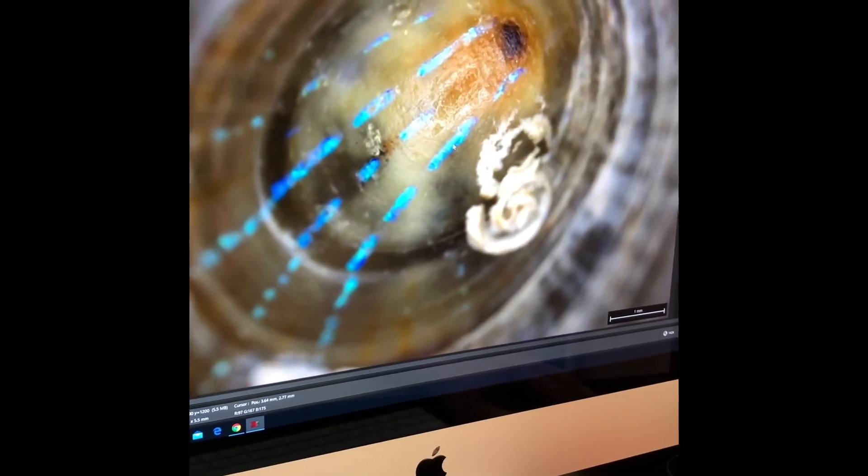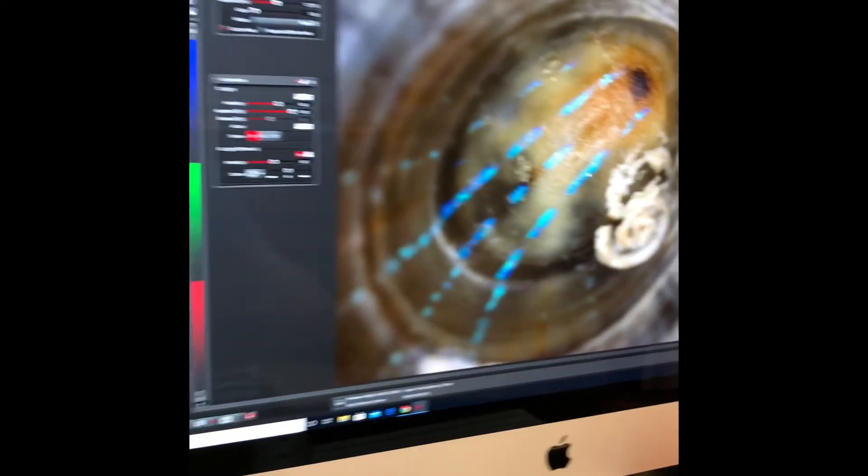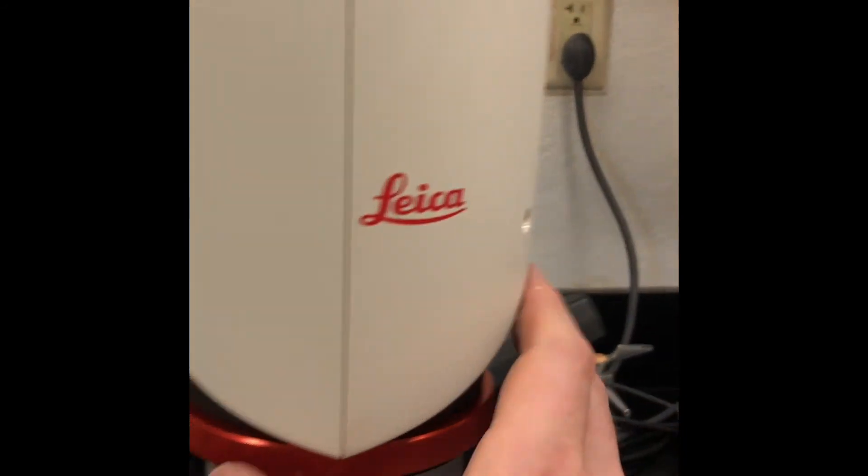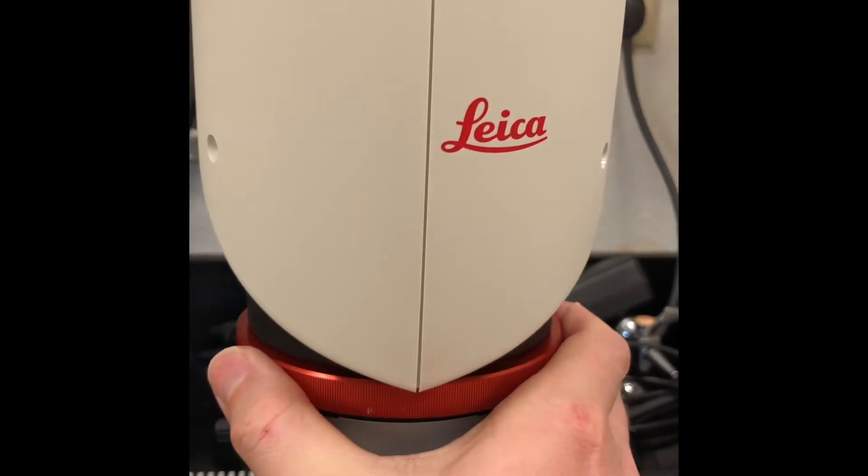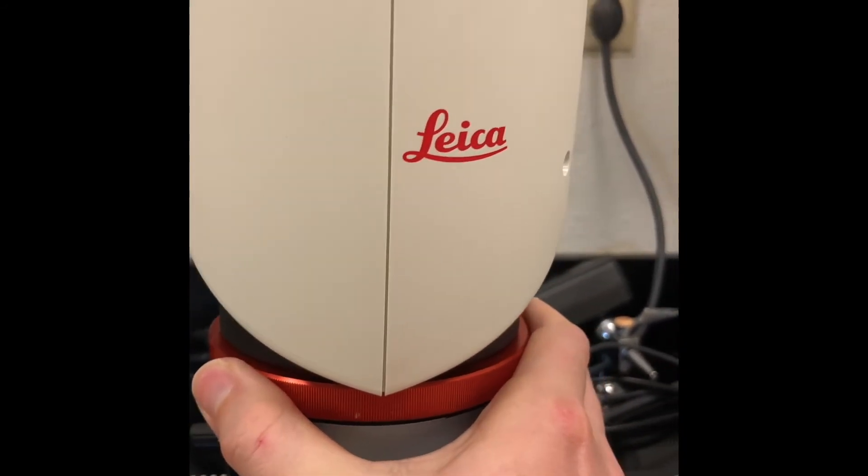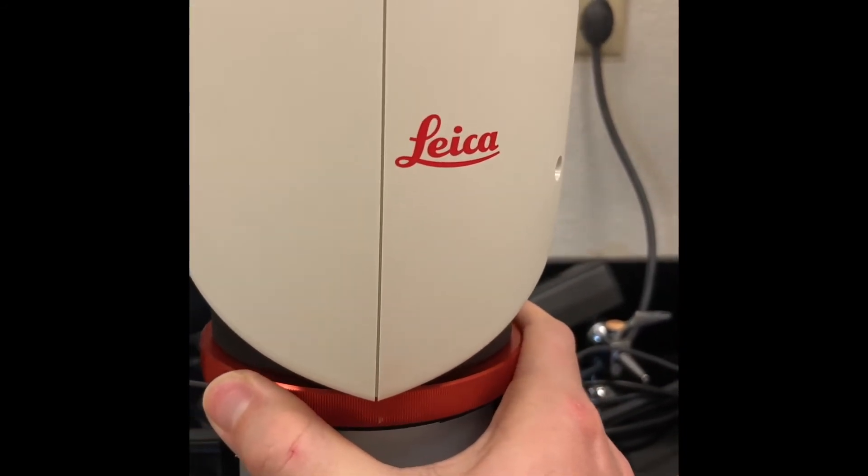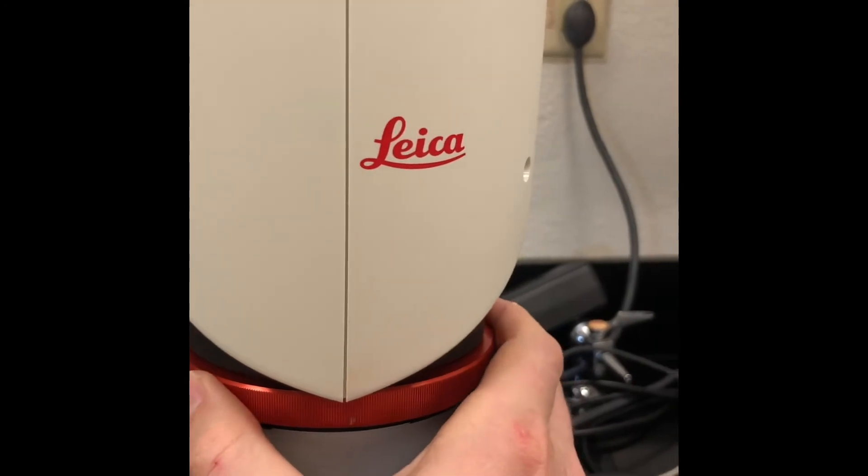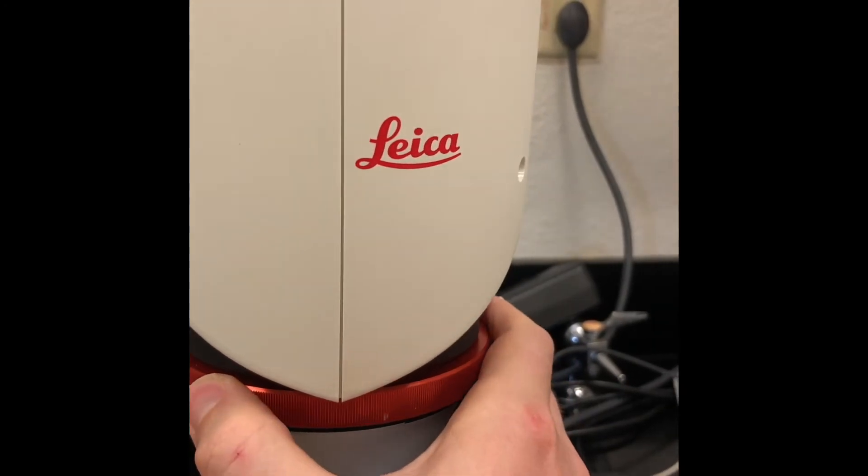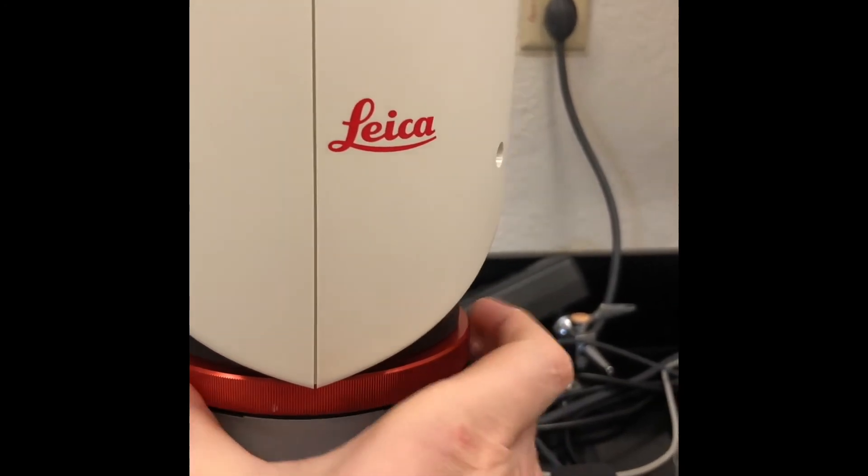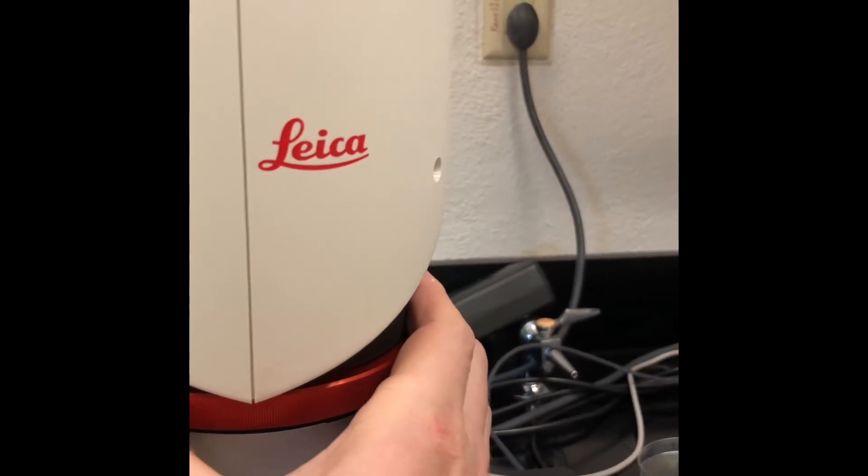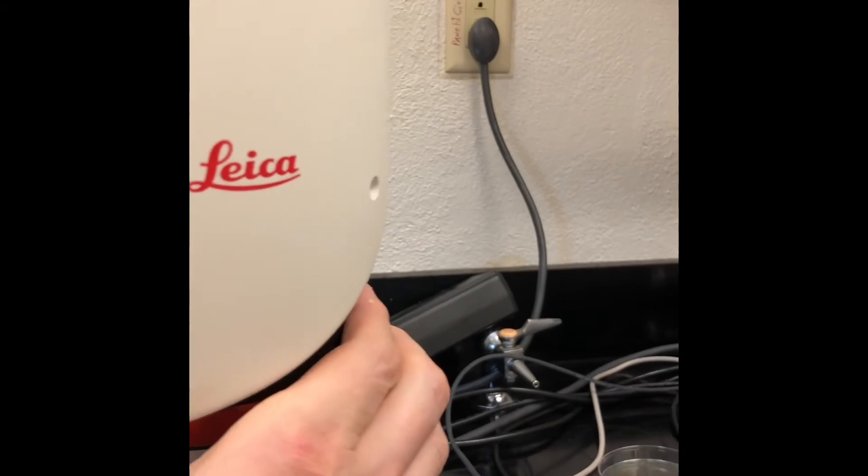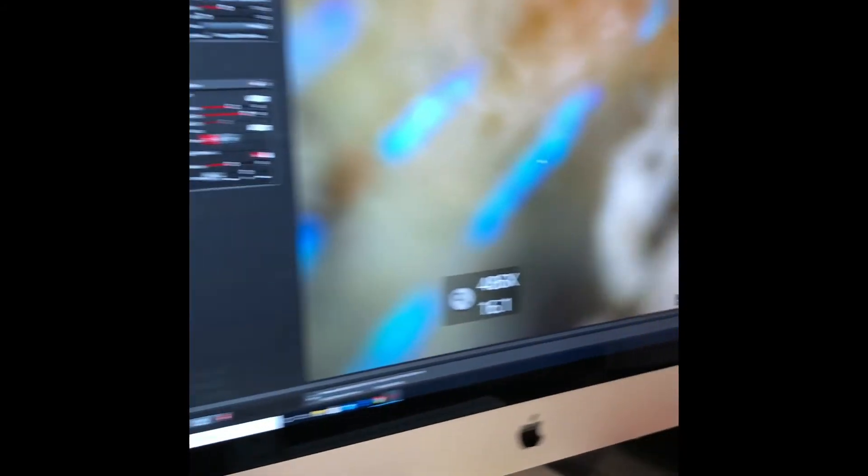So we can then zoom in on that. To zoom in, we'll then rotate this red collar. Now we're at 486x.